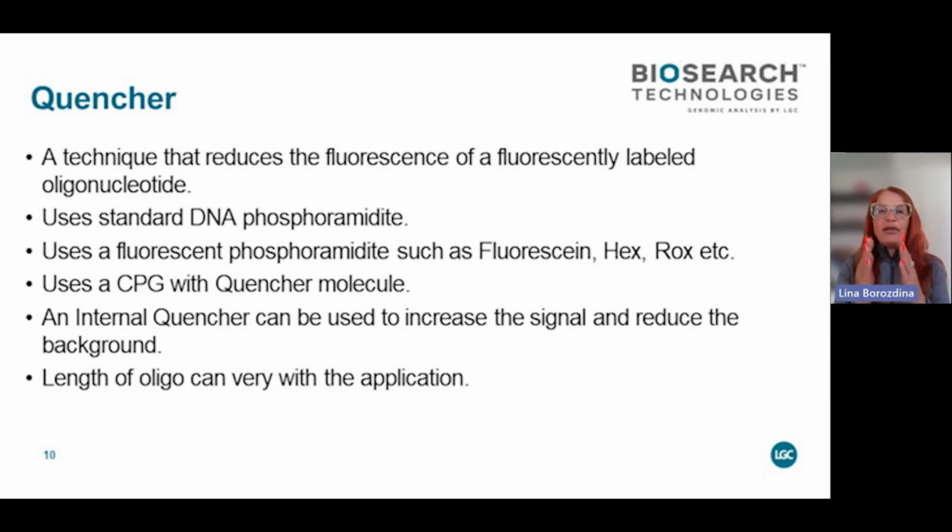So if you have your oligo that folds like that, with the quencher here and the fluorophore here, it doesn't fluoresce because they're close and the quencher covers the fluorescence. When you add it to your assay and it finds a match, for example the presence of positive COVID, the oligo unfolds. Hence, it separates the quencher and the fluorophore, and then you will see the fluorescent reaction.